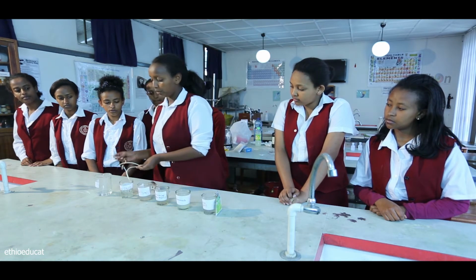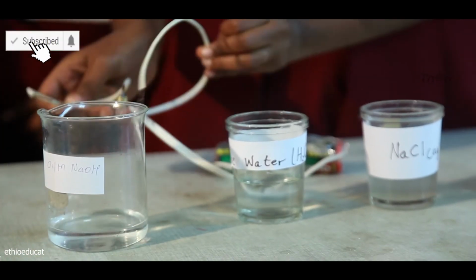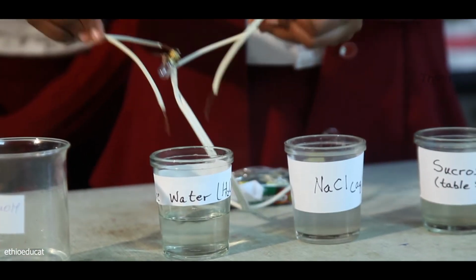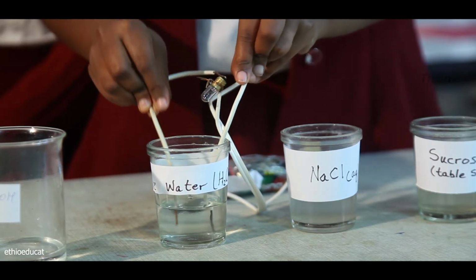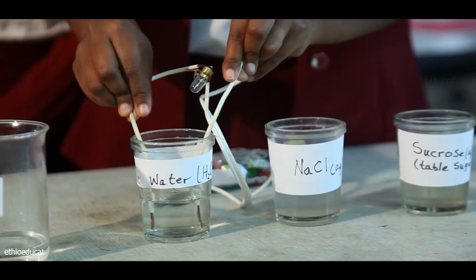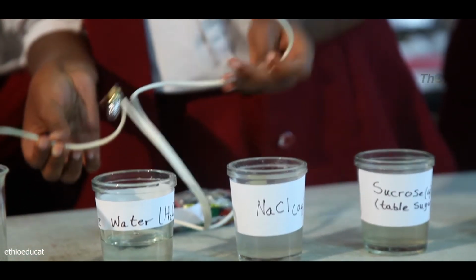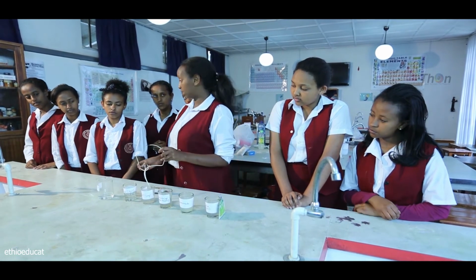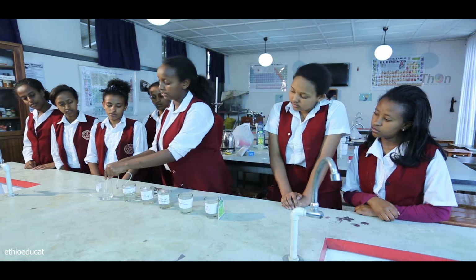Before we insert, we have to rinse it just to clean it. This is the water we'll be using to clean our apparatus. So let's insert it into the water and see if the bulb lights. Are you seeing any light coming from the bulb? No. Okay. So that means that water is not an ionic bonded compound. It's actually a molecule. That means it's made by covalent bond. So I'll rinse the apparatus again.